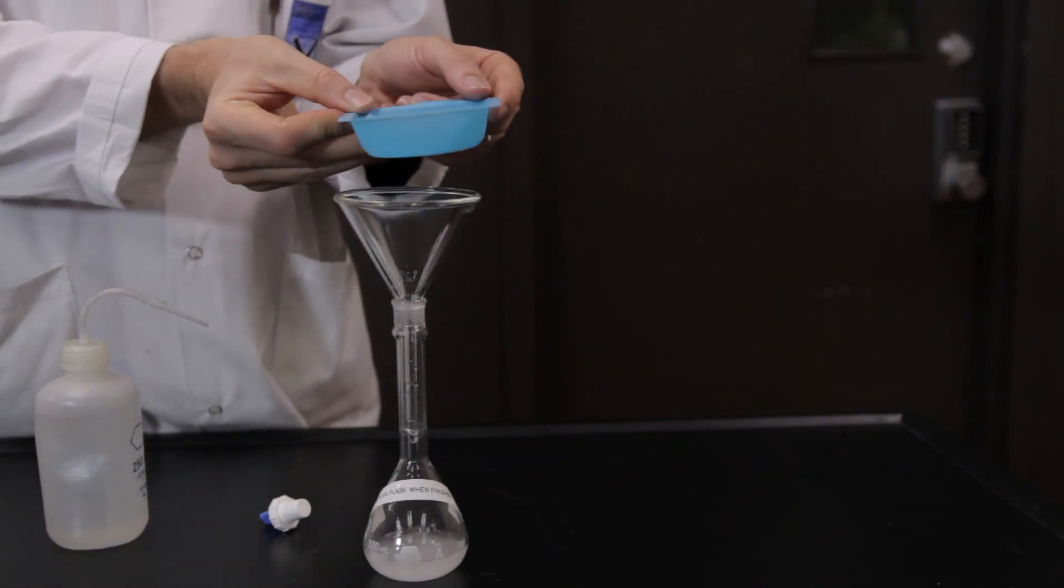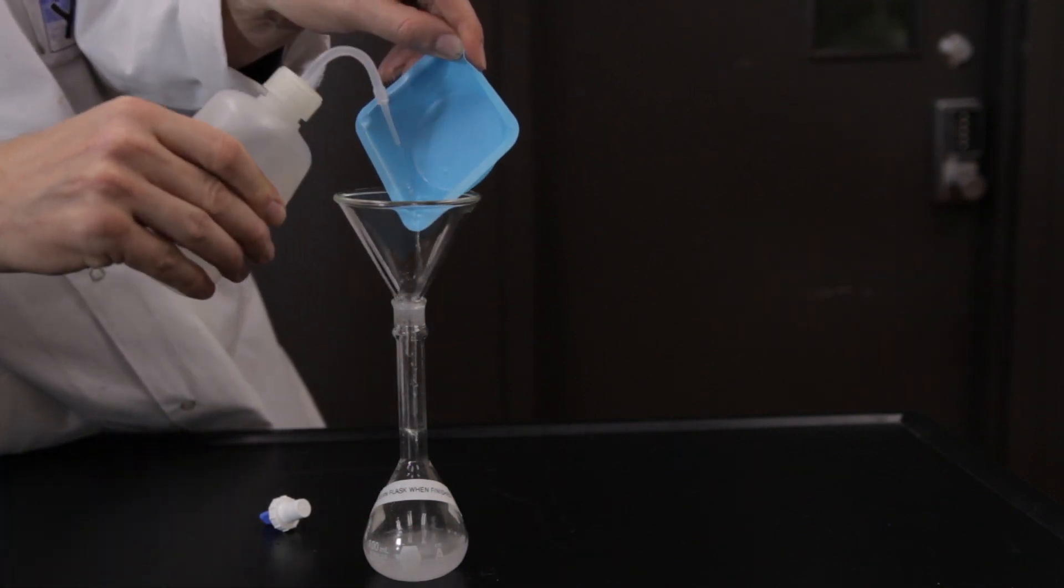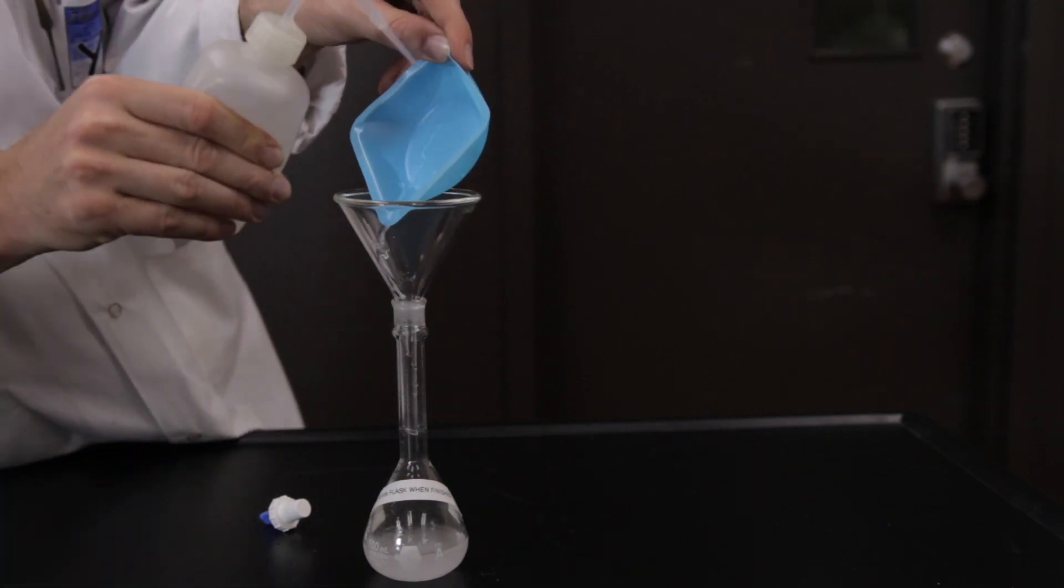Make sure to rinse the weighing dish with more water to ensure that all of the calcium chloride dihydrate has been transferred to the volumetric flask.